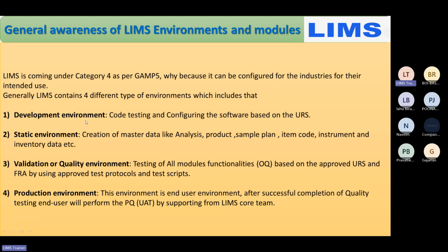Then comes the static environment, where the master data is created. What is master data? You can say master data is the brain of that particular software. Relating to this master data, the software is going to give the results. For example, different guidelines, SOPs or specifications will all be recorded first as the brain within the LIMS software. By referring to them, suppose one product is there and an analysis test is required, that test will be created by following this master data only. How this static environment is created, I am going to explain in further lectures.